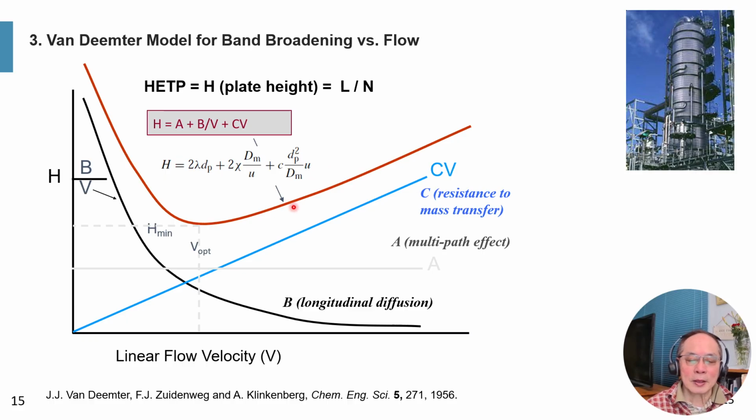So it is a theory to relate the separation efficiency of the process with the chromatographic process. Now, obviously, in chromatography, you have many more plates, even though there are no physical plates inside a column. All you have are these porous particle columns.